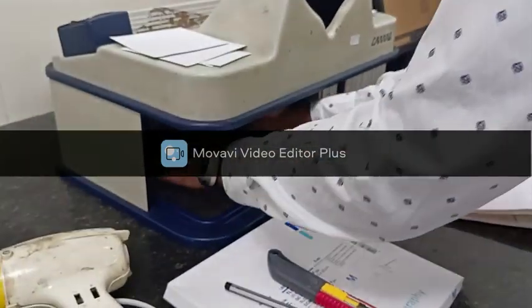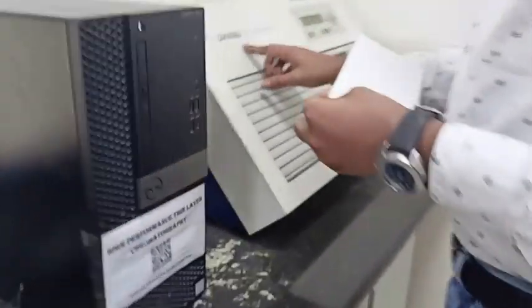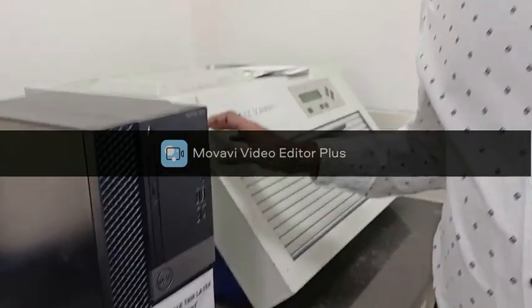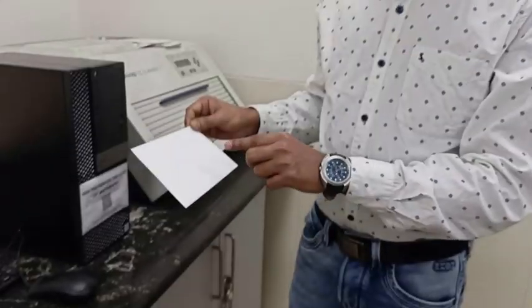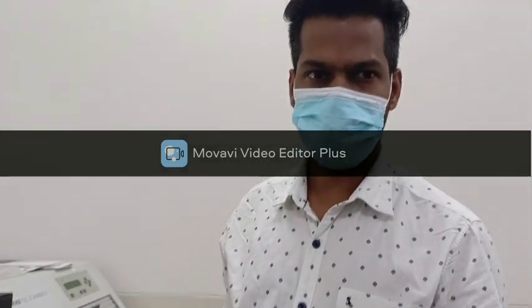Then we will scan these bands using this CAMAG TLC Scanner 3, and we will use the VisionCATS software for this. This scanner will scan the various bands and it will give the absorption peaks. From the absorption peaks versus various concentrations of the standard solution, we will prepare a calibration line, and from this calibration curve we will get the concentration of the unknown sample. So thank you.